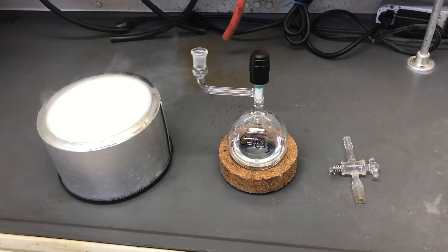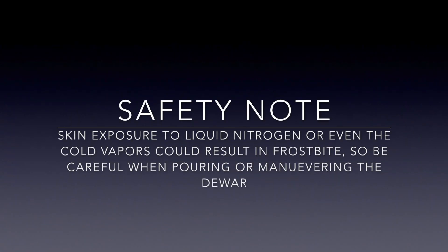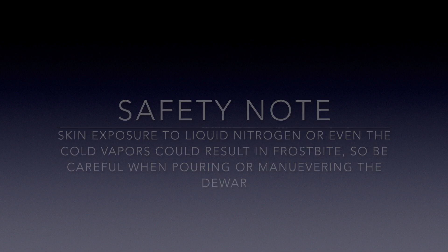To do freeze-pump-thaw, you'll need a flask with your liquid that can be connected to a hose from the Schlenk manifold, and a Dewar filled with liquid nitrogen. The liquid has not been prepared in any special way — just pop open the bottle and pour it in. Safety note: skin exposure to liquid nitrogen or even the cold vapors could result in frostbite, so be careful when pouring or maneuvering the Dewar.